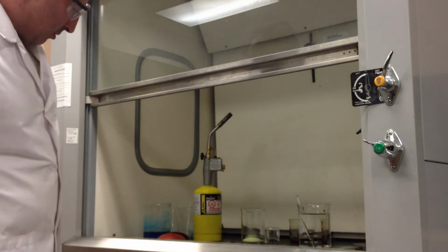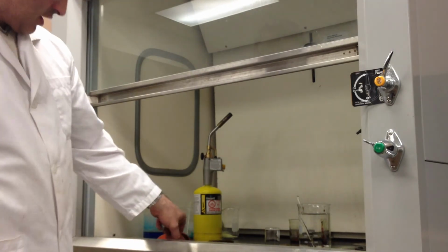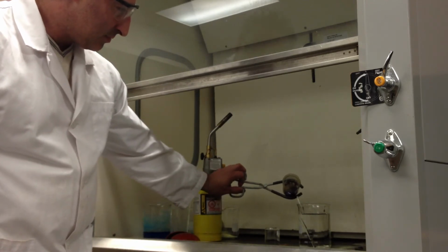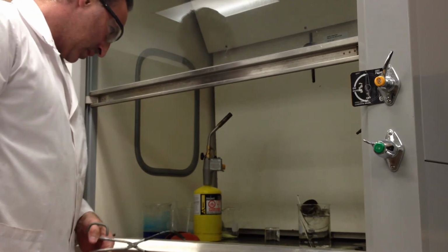Now we have a little bit of a problem here because the rest of the sulfur, as you can see, is on fire. It burns with a fairly interesting colored flame. See the color of that flame? It's blue. Ooh. Oh my god. That's good.